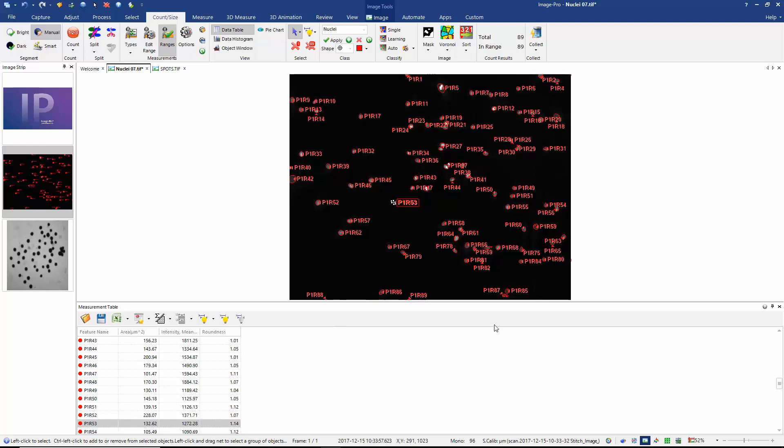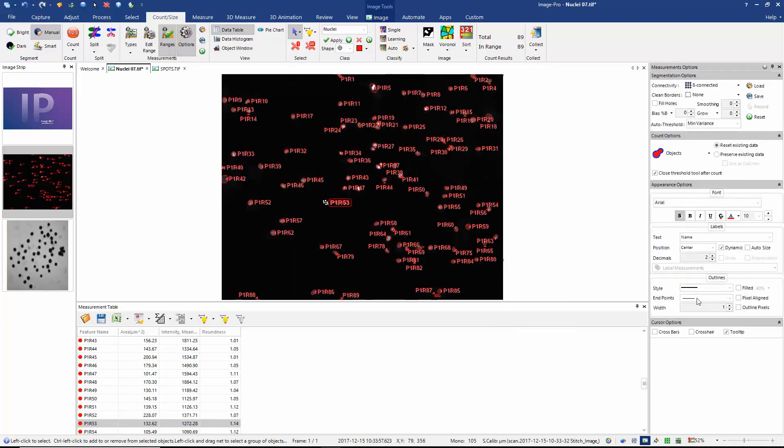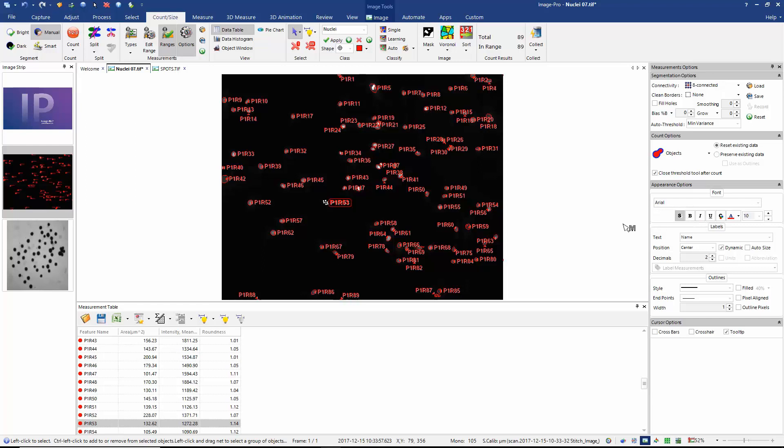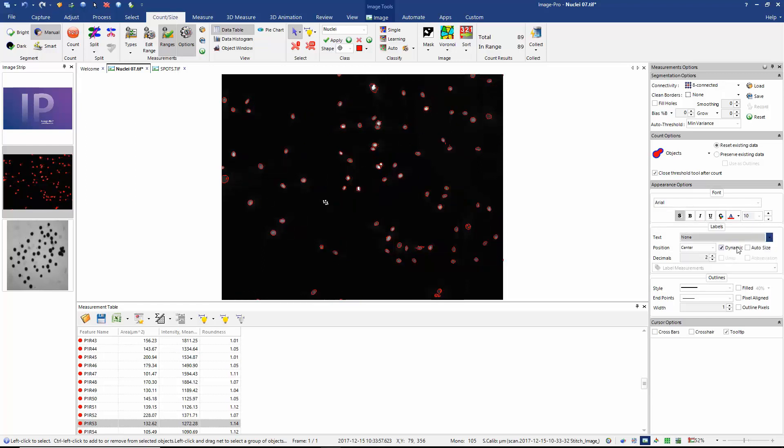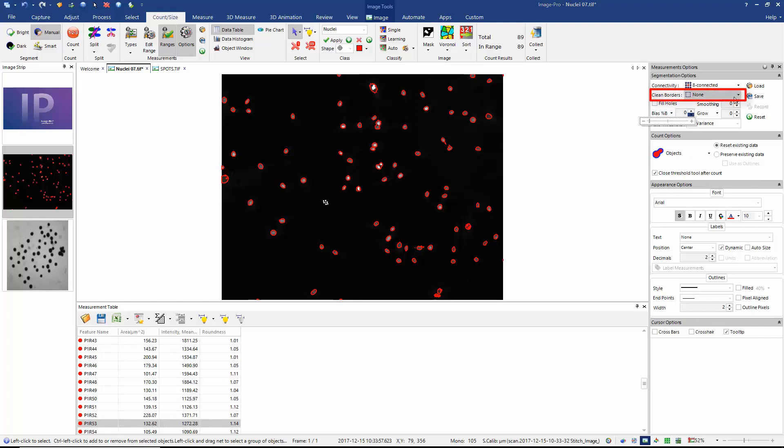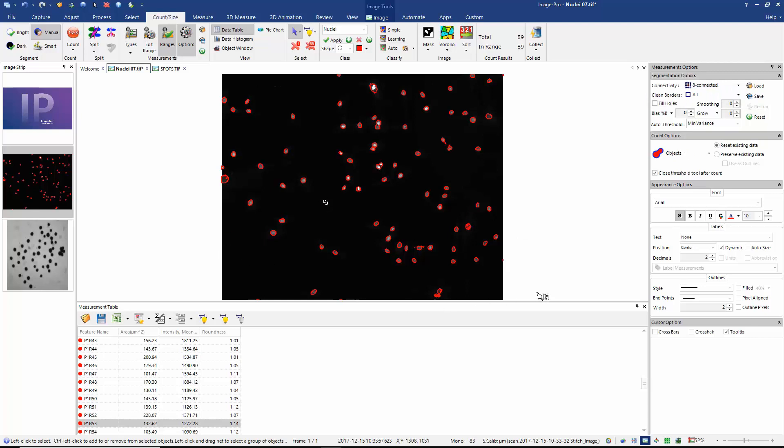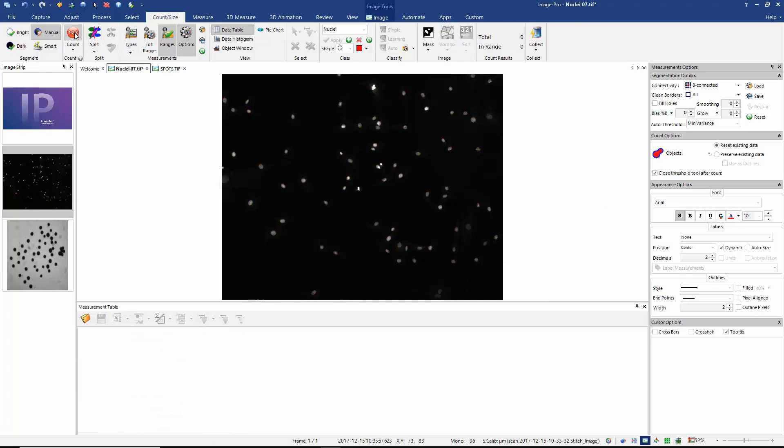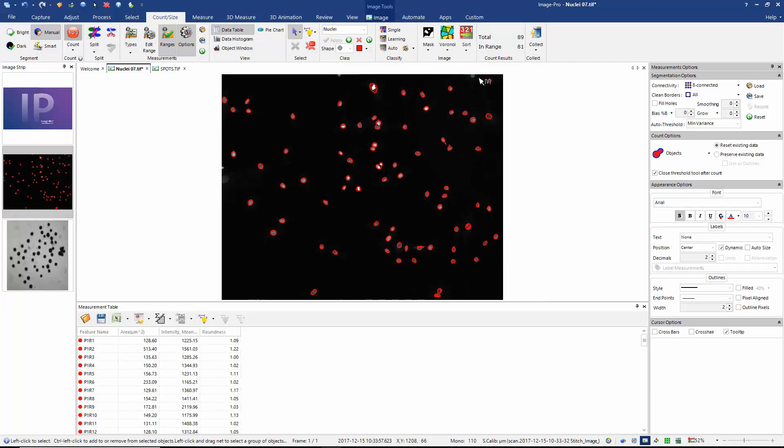Next, I'm going to select my measurements options, which we find here in the ribbon. And when I select them, they're displayed by default on the right of the application. Here I can decide whether I want to include text in my measurements. So by default, we're displaying the name of each measurement. I'm going to change this to none. I can also perhaps change the width of the line with which my objects are displayed. And it's very common to exclude any objects that touch the edges of the image. This is because we can never know their true area or true mean intensity. Now the option to exclude objects that touch the edge of the image is called clean borders. And here I can set my clean borders to all. That means any object that touches the edge of any part of the image will not be counted. So if I clear my measurements and now recount, we now exclude any objects that touch the edge of the image.